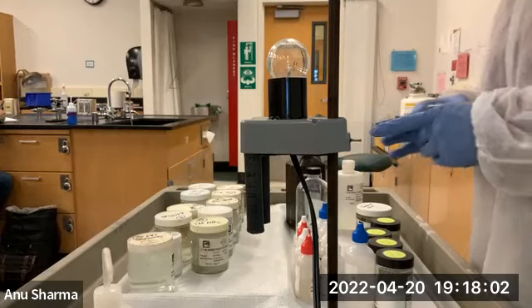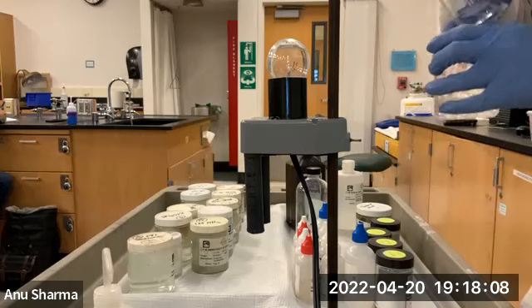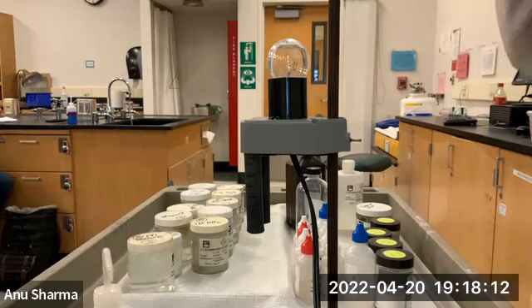All right, so that was one thing. Now, let's get the other one. So that was number 6. Number 6: non-conductor, non-electrolyte. The major species is the full molecule of C2H5OH and water, and the minor species is none.